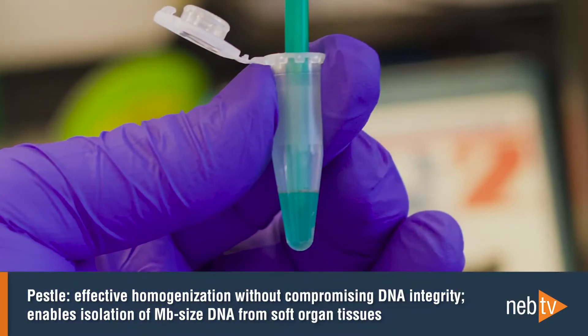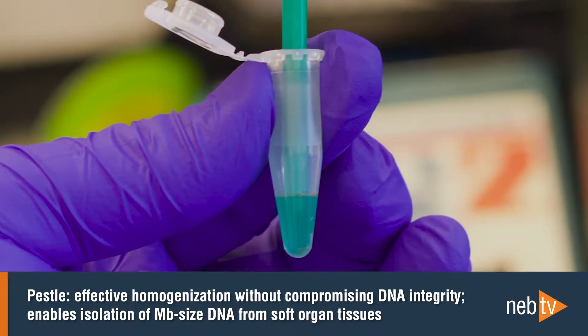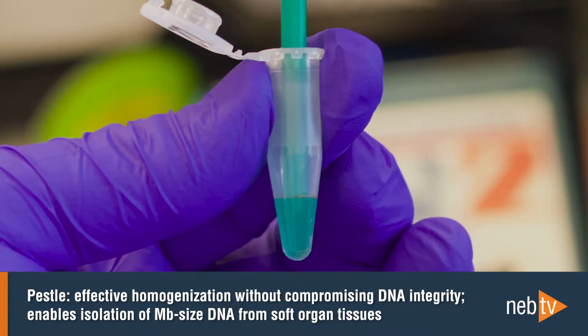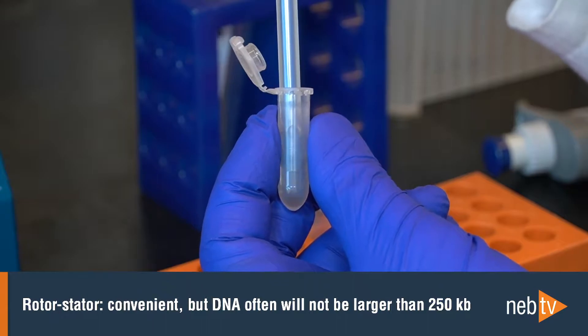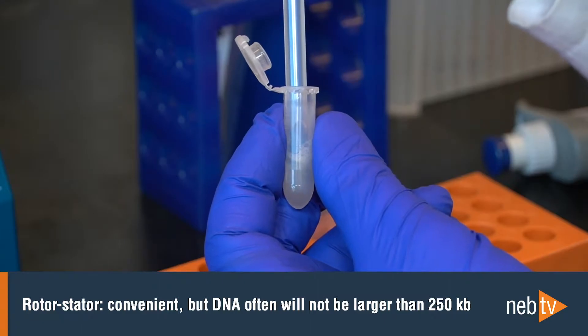When working with soft organ tissues like liver or kidney, PESL homogenization allows for the isolation of DNA ranging into the megabases. Rotor-stator homogenization is a convenient solution, but usually will not produce DNA much larger than 250 KB.